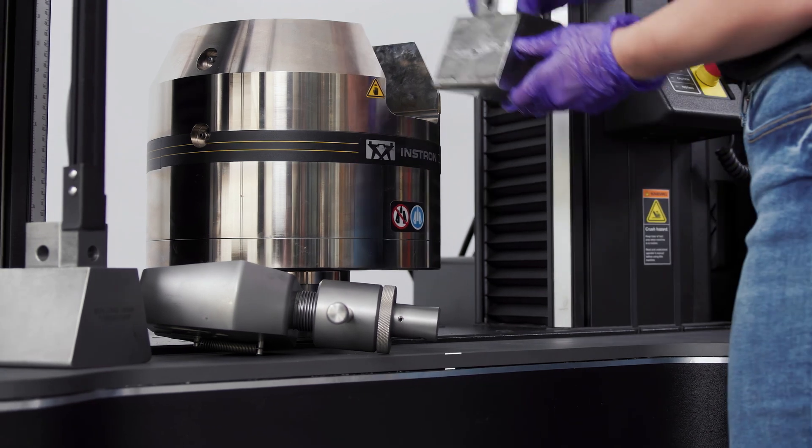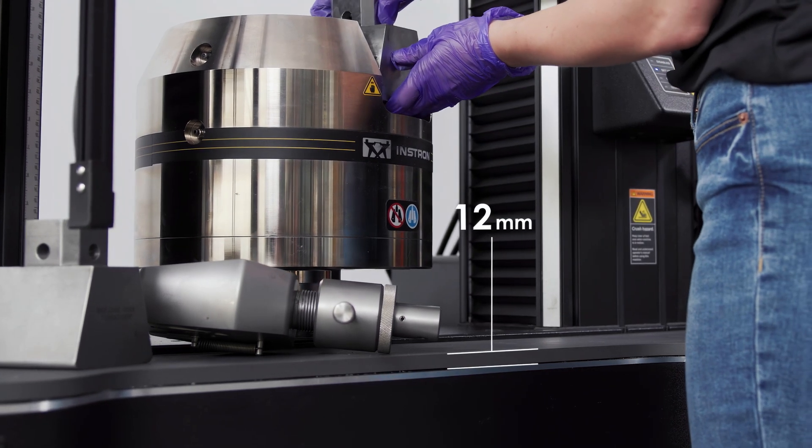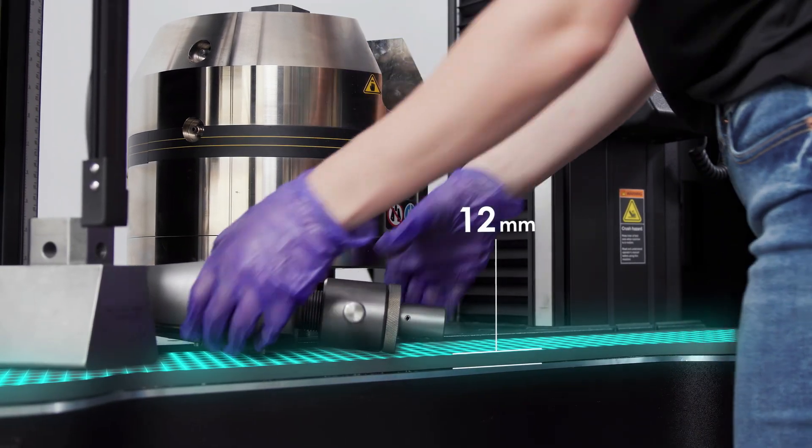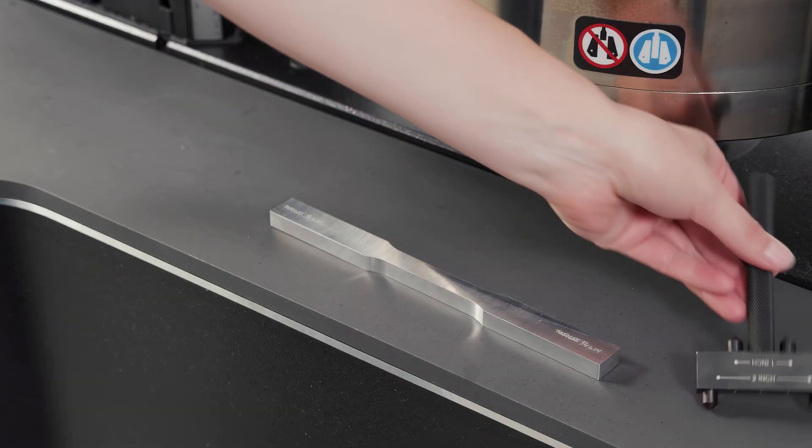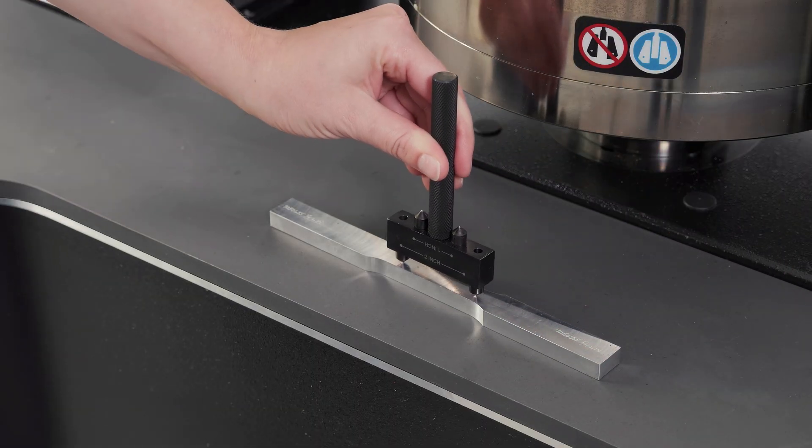The durable metal work surface is 12 millimeters thick and treated with an abrasion-resistant ceramic coating, allowing it to withstand the day-to-day demands of testing high-strength materials.